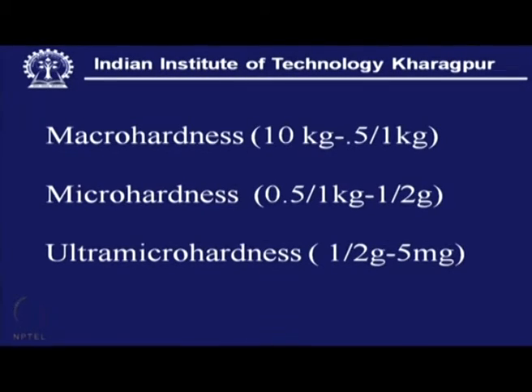Now, the question is, we are talking about coating. The coating means here we are not referring to measurement of hardness on a bulk geometry, but on a coating.